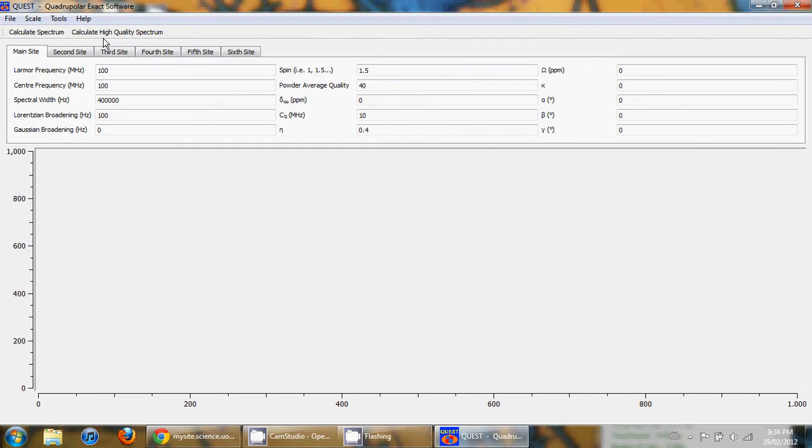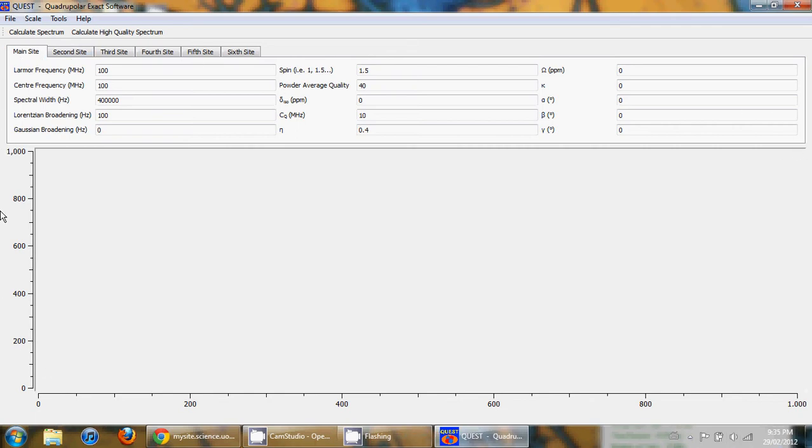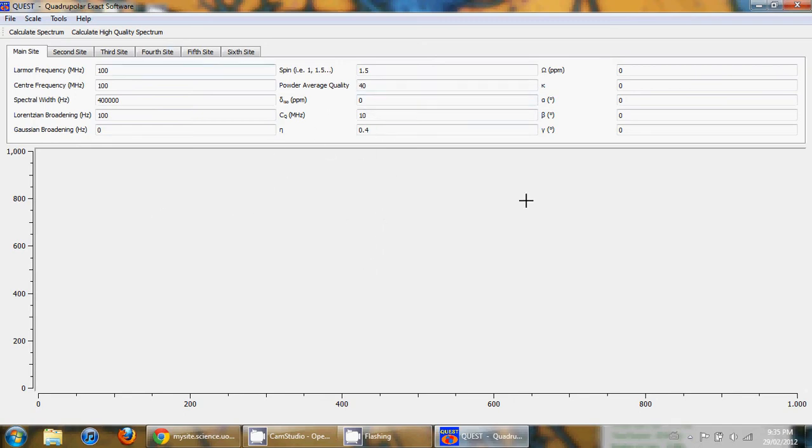Quest stands for Quadrupolar Exact Software and it is a program for calculating the exact static NMR line shapes or NQR line shapes for quadrupolar nuclei. This program works without the use of approximations and is valid for any LRF or any size of quadrupolar interaction.